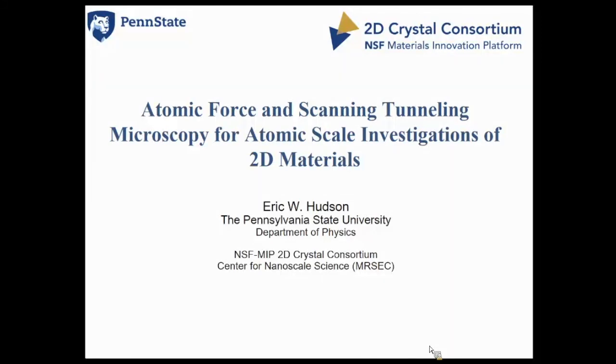So I'm narrowing the focus to AFM and STM, and I'm going to be presenting in somewhat of a tutorial style. Please, if you have any questions along the way, feel free to just yell them out at me, and I will try to answer them rather than holding them until the very end, in which case I forgot what I was talking about when you had the question.